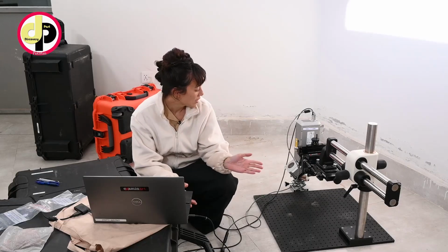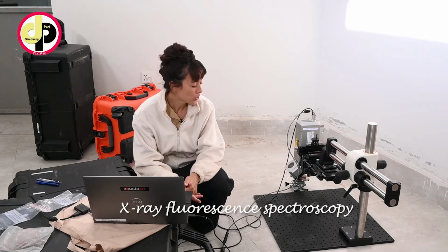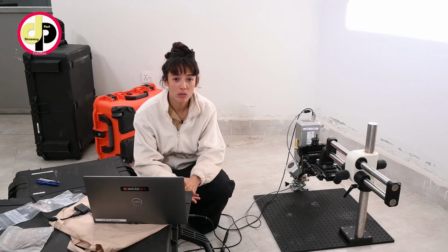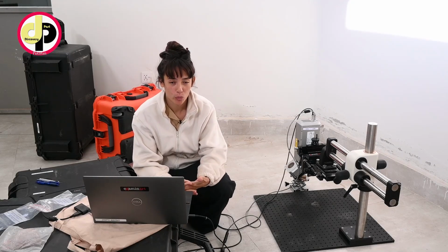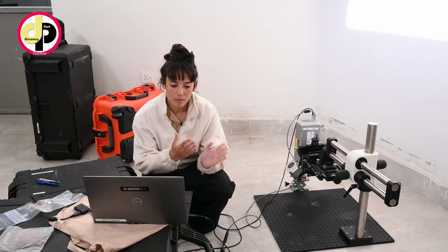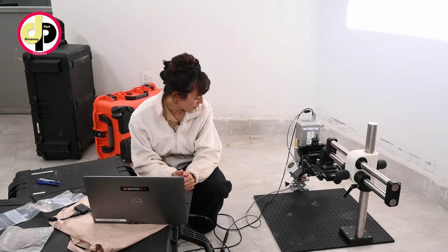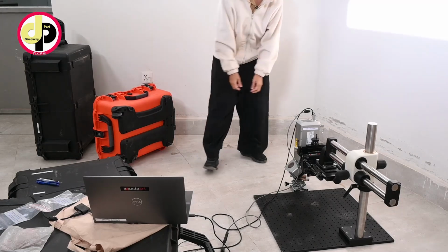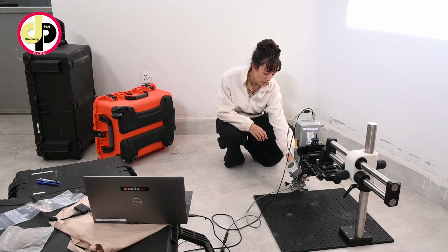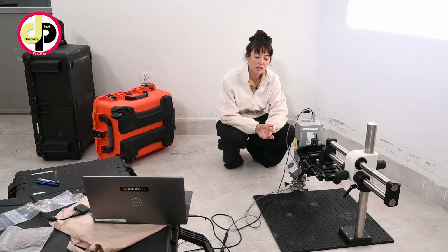So this machine combines X-ray fluorescence spectroscopy and X-ray diffraction. The X-ray fluorescence spectroscopy will give us information about the atomic composition. And the X-ray diffraction will give us some information about the crystalline form of a molecule. So this is a complementary approach to the Raman spectroscopy. So we place the material here, and X-ray will be focused on the surface.